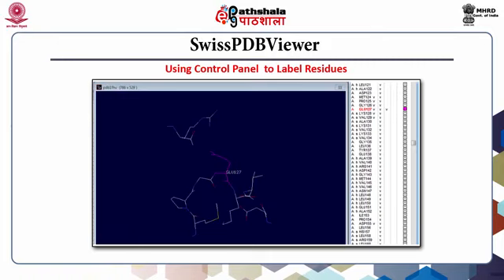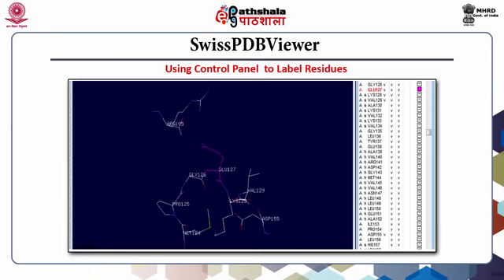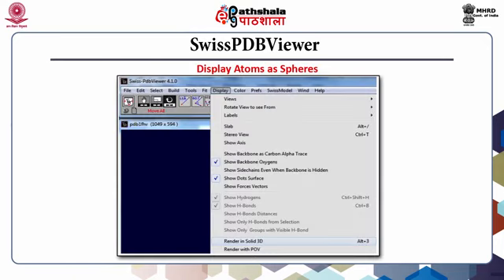Therefore, combination of pressing Shift key with a click is used to display or hide any feature such as display label, display backbone, display side chain. This will display the label for all the displayed residues. Press Shift key and click in the third column. It will hide all the labels. Press Shift key and click anywhere in the fourth column.